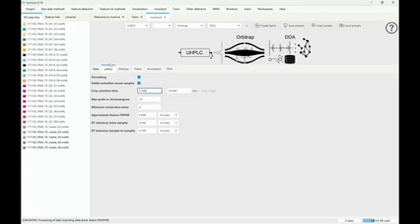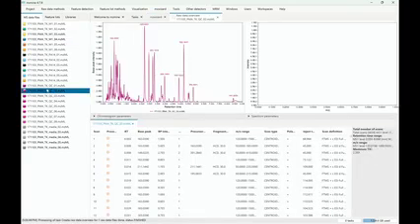In UHPLC, we have to look at our chromatograms and maybe cut out some parts, right? Maybe in the front we divert to the waste, maybe we want to cut this out, and maybe at the back we have some clean out step in our chromatography. So for doing this, we can open the raw data overview, and for this I will just double click on one of those samples. So in the MS data files, first, you have to import the file.